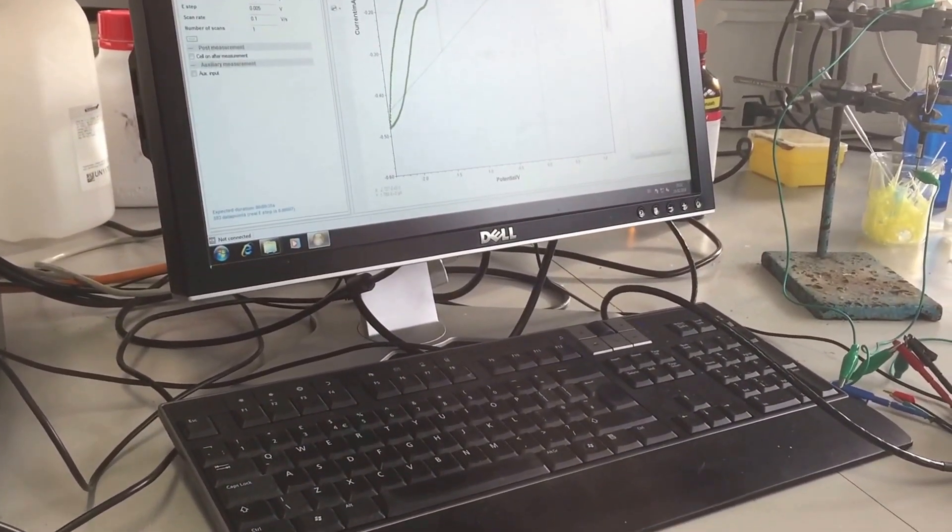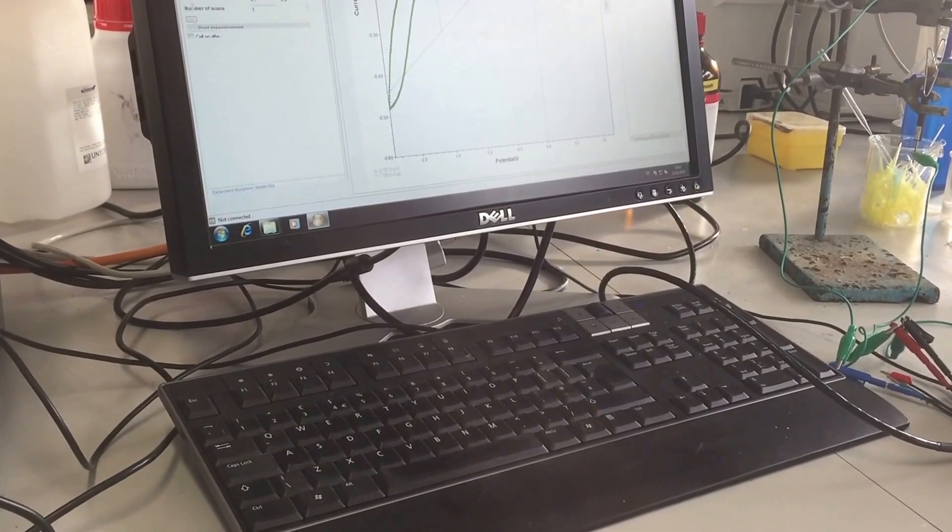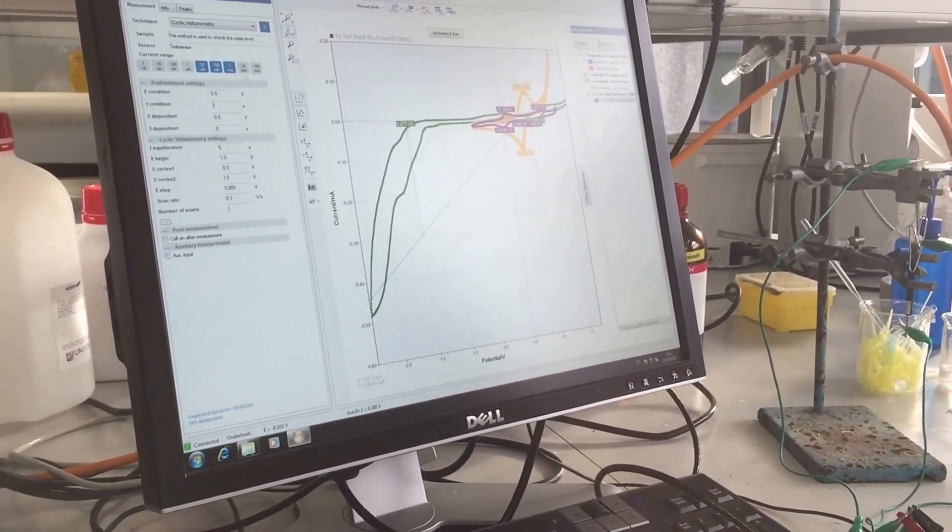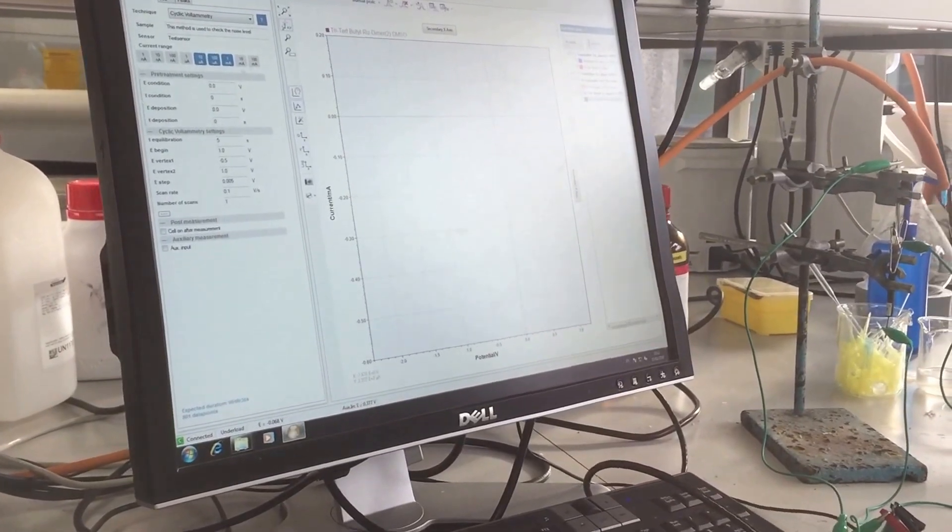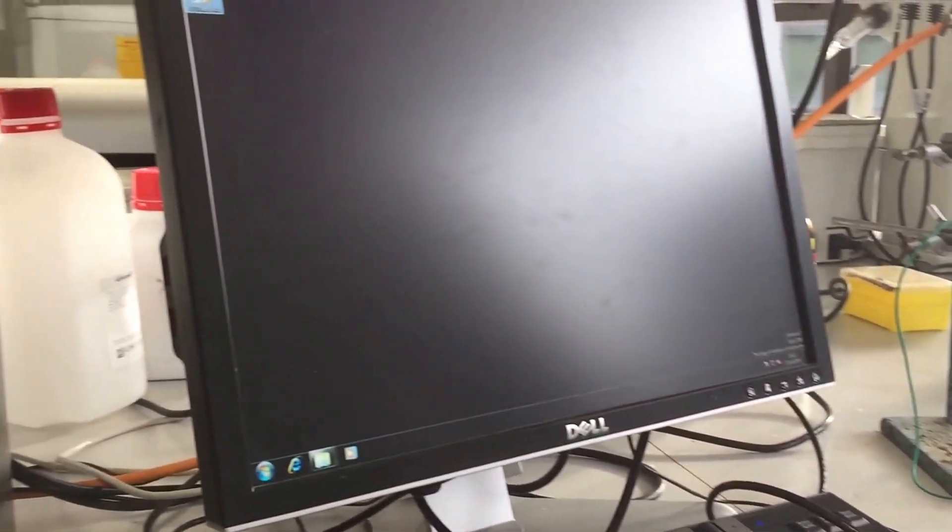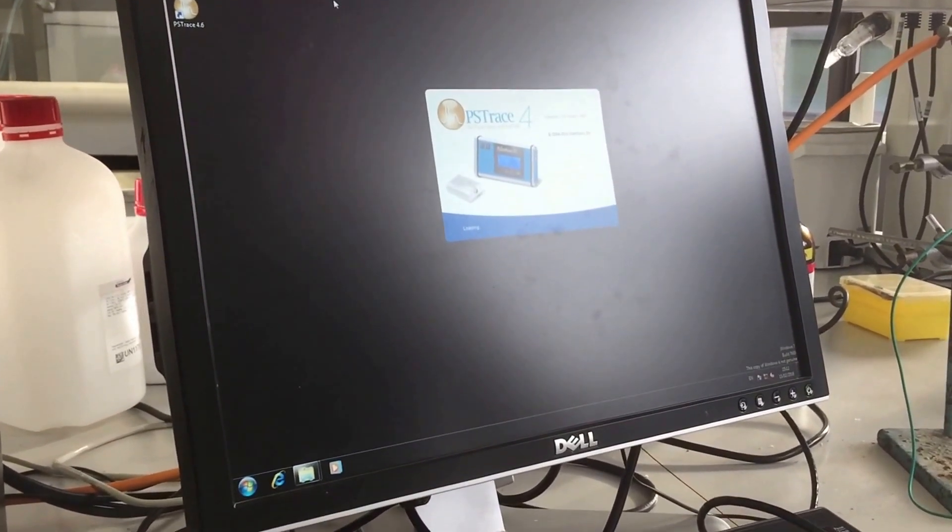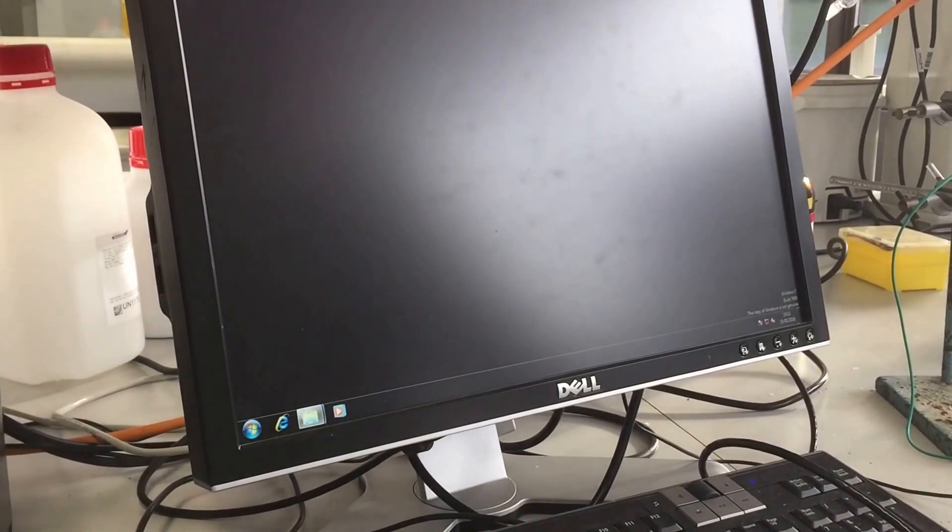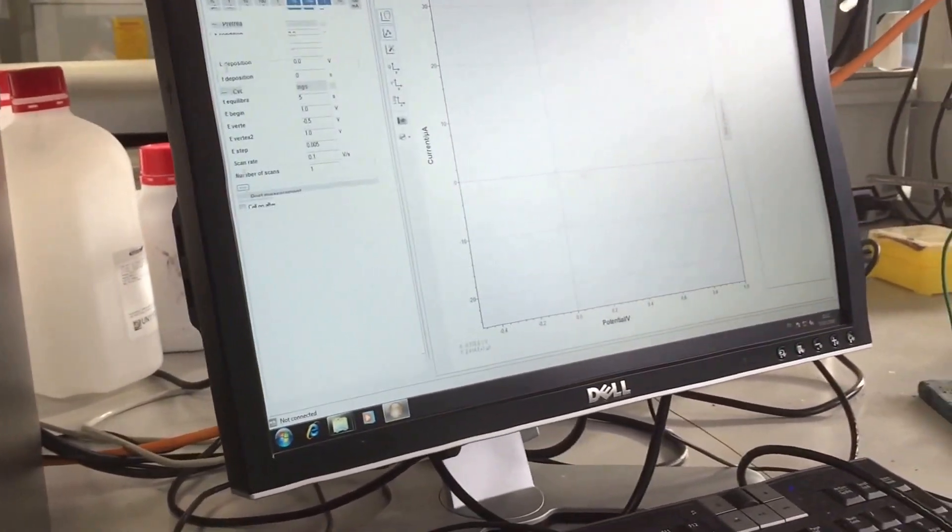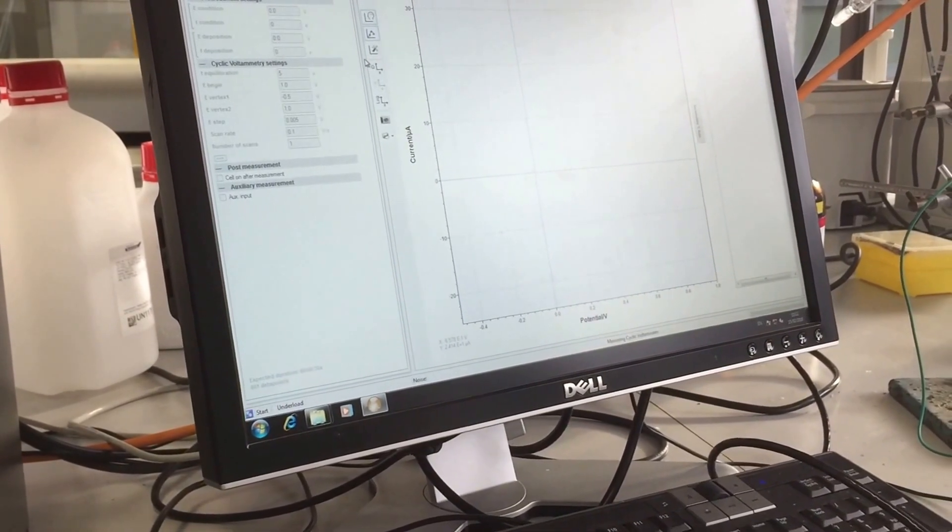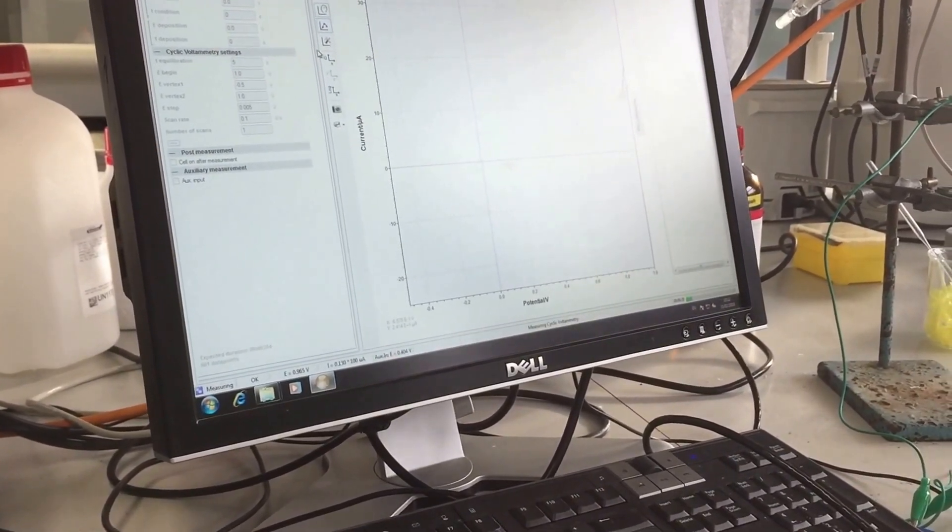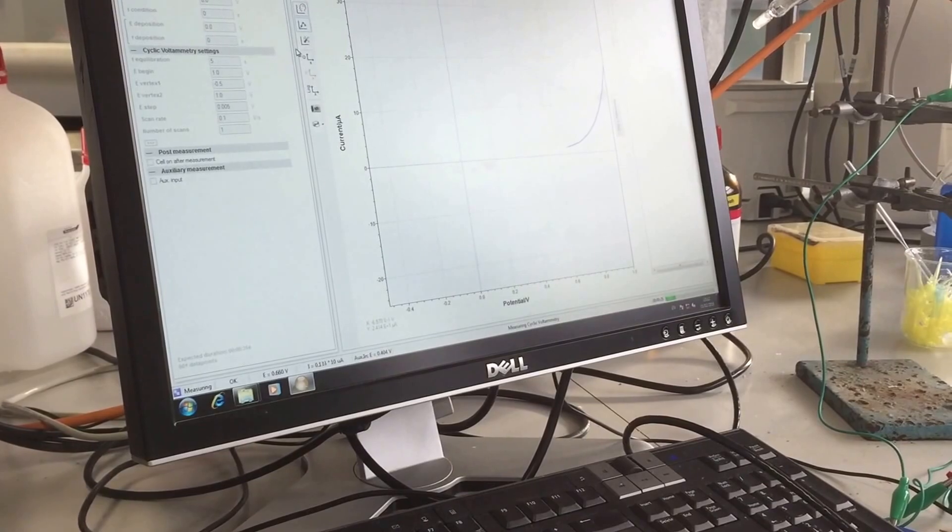Alright. Get rid of that piece. I think this can be clear. We're just going to try this one. I think this is actually. I'll try that. Nice. I think this is one more side.